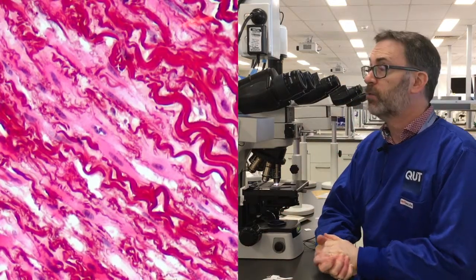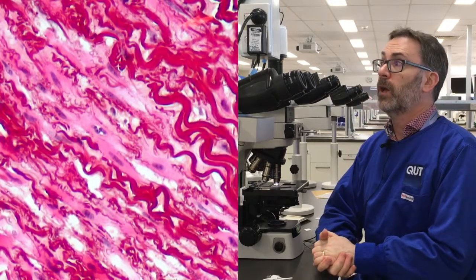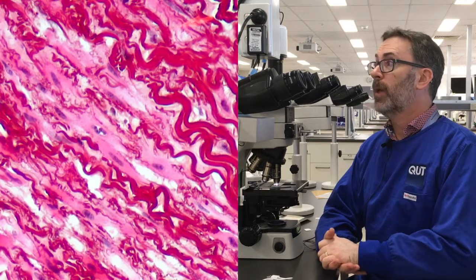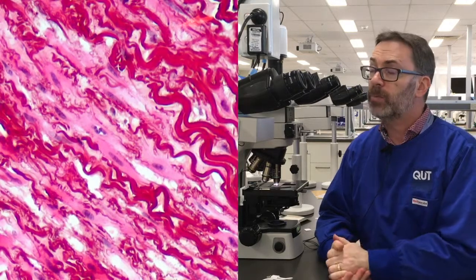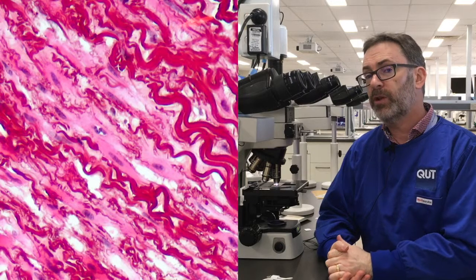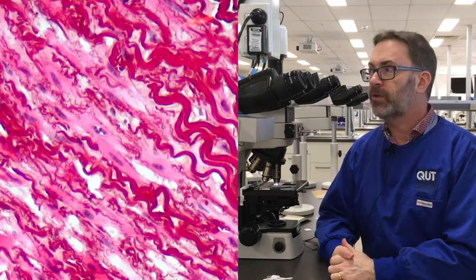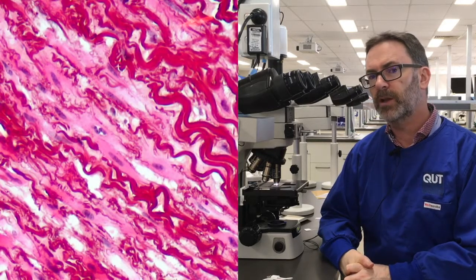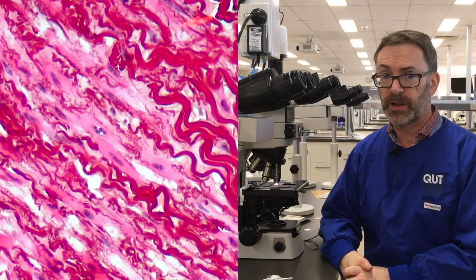So there's an example of some orcein stains. Typically it is less technically challenging to perform, but pay attention to the Mayer's — do it progressively and be careful that you don't overdo it. With your initial rinsing in the alcohol, make sure you do it sufficiently to get those collagen fibers clear. And if you still think there's too much color there, you can go to the acid alcohol briefly — do it progressively in small steps, and you should have no trouble with this stain.